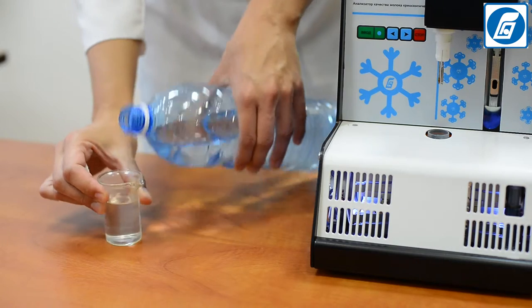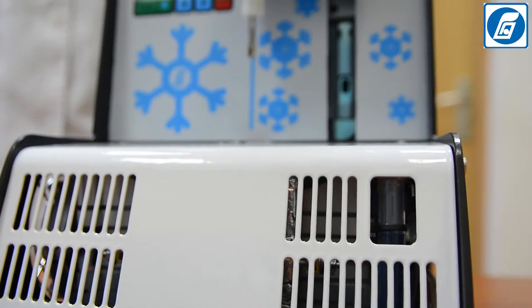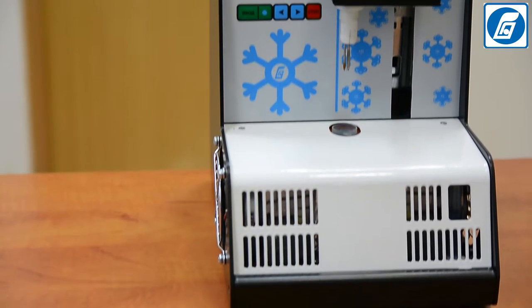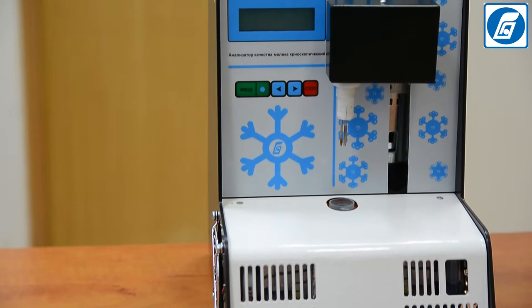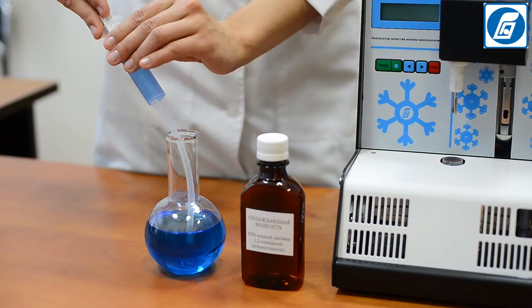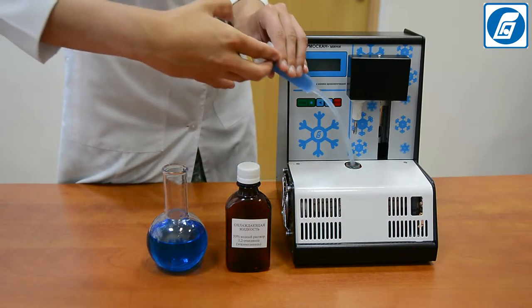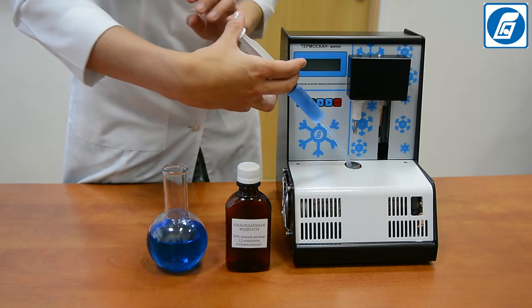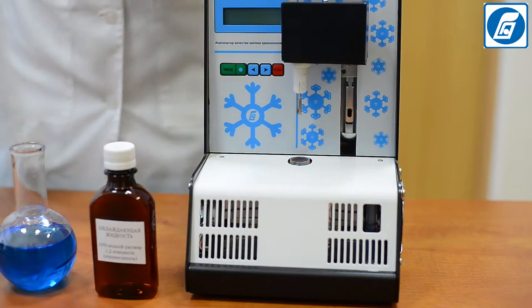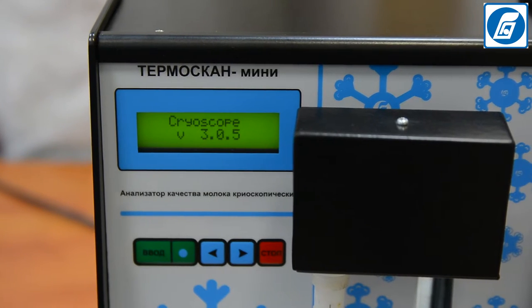Fill the cooling bath with cooling liquid — a 33% water solution of ethylene glycol — up to the given mark using the syringe fitted to the silicone drainage tube provided in the set. The approximate volume is 120 to 125 ml. Switch on the analyzer by putting the power switch in position 1.